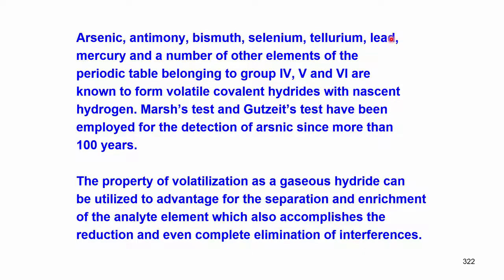So, this property of volatilization as a gaseous hydride can be utilized to advantage for the separation and enrichment of the analyte element, which also accomplishes the reduction and even complete elimination of interferences.